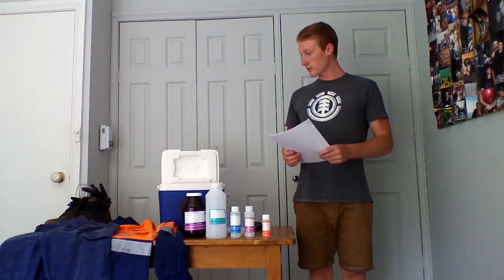So firstly we'll have a look at the purpose of these procedures. We'll move on to safety factors of sampling surface water, including accessibility to this location site, and we'll also have a look at personal protection equipment. We'll then have a look at the procedure, sampling method. We'll have a look at factors affecting sampling, quality control samples, types of different sampling containers, and then I'll demonstrate how to take a water sample.